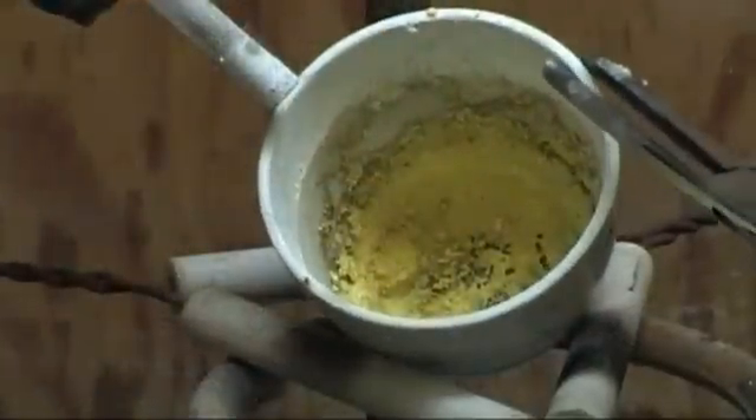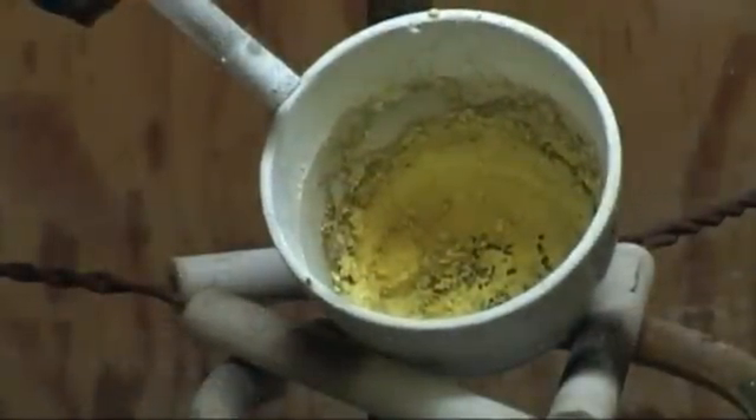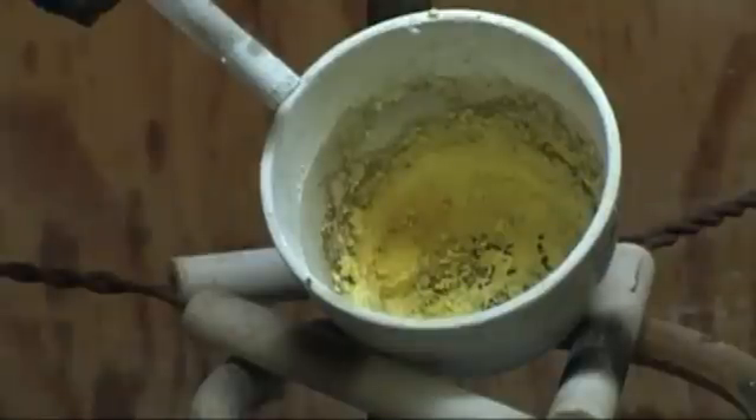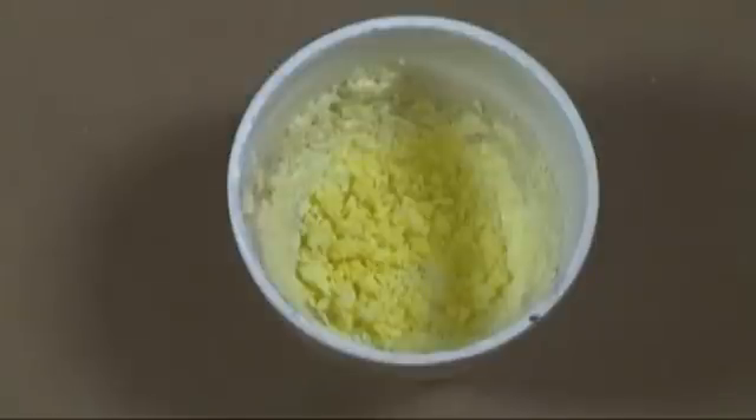After a few minutes, the reaction will slowly come to an end. If you quickly look into the vessel, you will see that everything has a dark gray color. But if you continue to watch, the dark gray will slowly become a striking yellow as it cools. Here you can see some of the dark gray, though most has changed to the yellow.